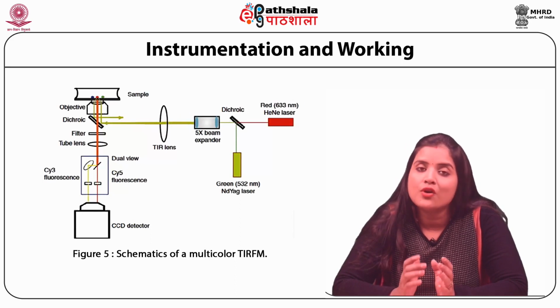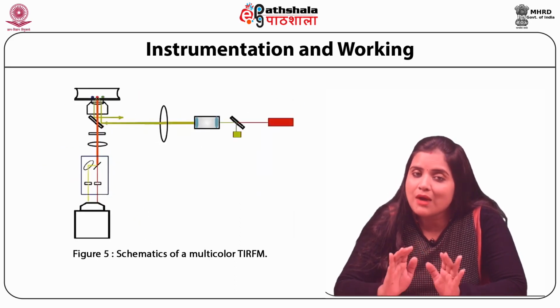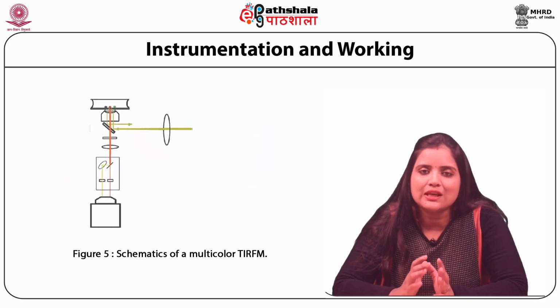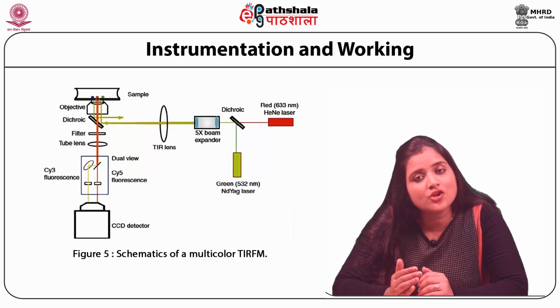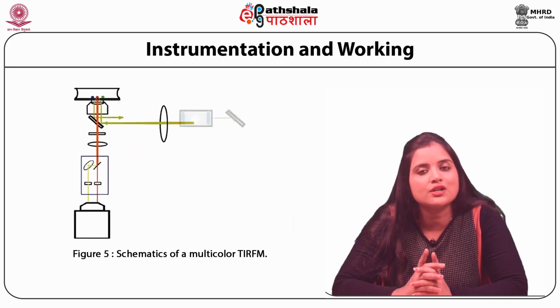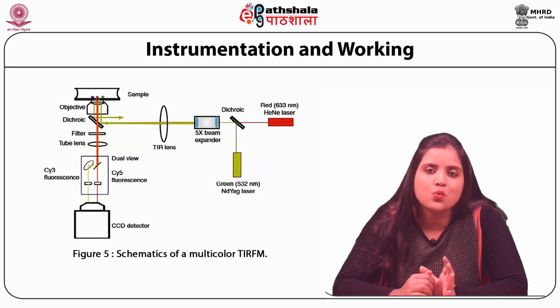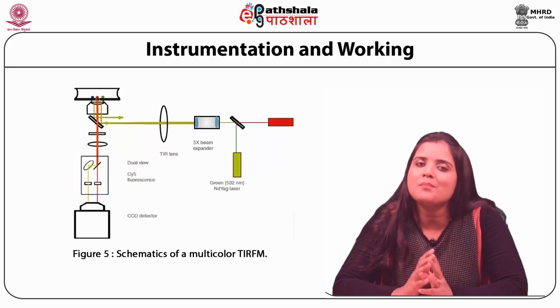A set of two irises are placed at the same height along the optical table such that the beams traverse the same optical path. The illumination spot is enlarged to about 60 micrometer in diameter by using a 5x beam expander on the XY translation stage along the optical path.